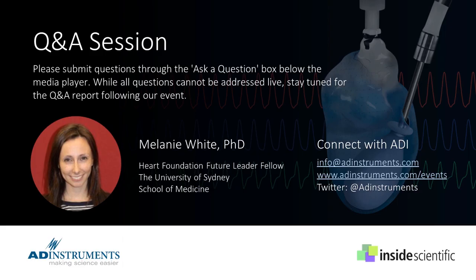Perfect. Okay. In your presentation, you mentioned that cannulation can be very difficult, and we have had a few questions come in about it. So, Melanie, what do you recommend when removing the heart and keeping it in the best condition possible? So, maximum cannulation time, or cooling the heart before removing it, and so on.